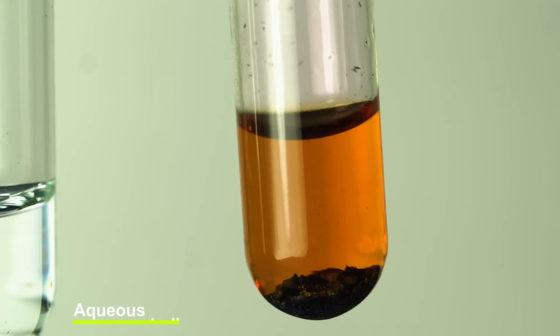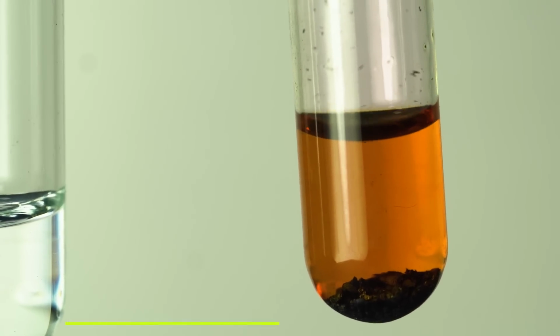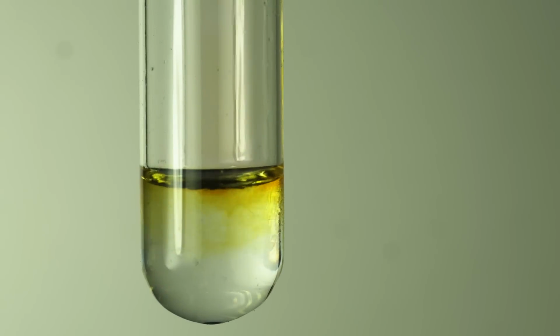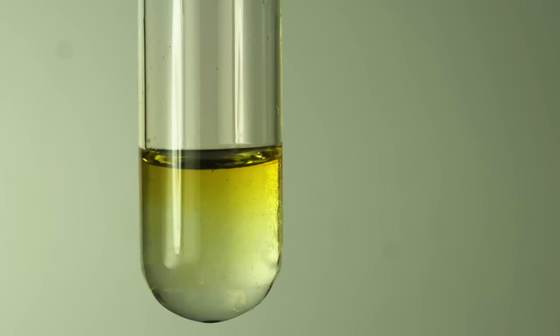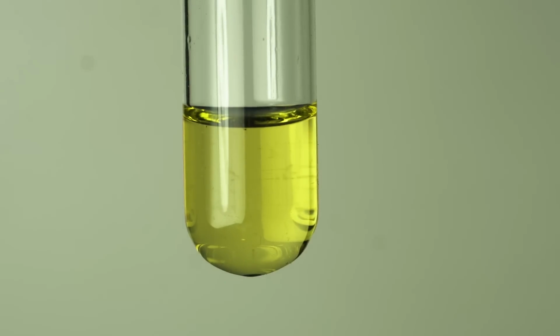Here's the same reaction, but with the aqueous solution of iodine, just for comparison. Reaction will not occur until we add a few drops of carbon disulfide.